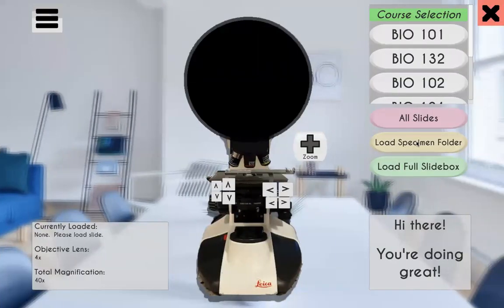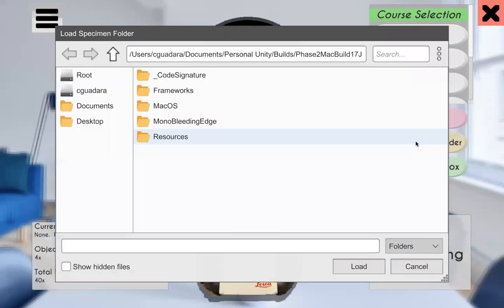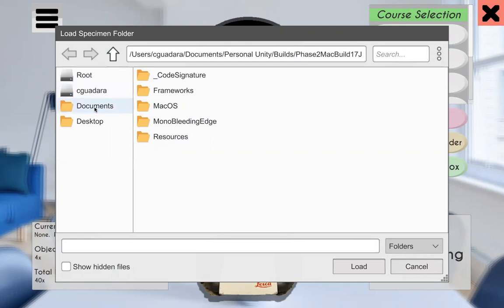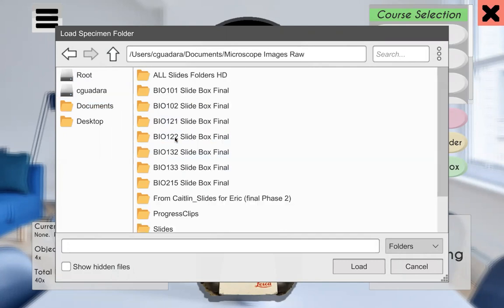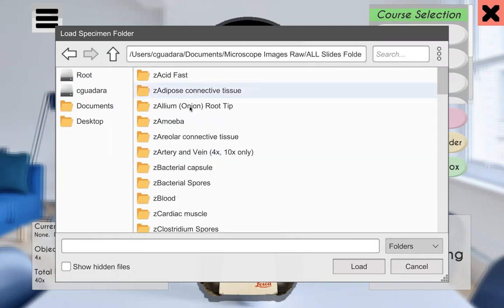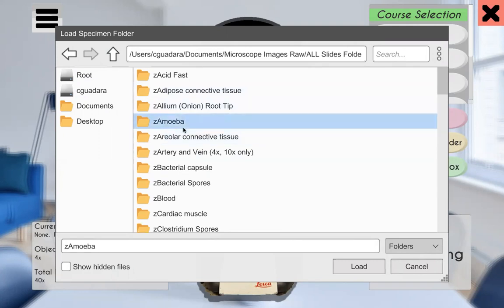Now to load a specimen folder, all we have to do is click the button, and in the in-microscope browser, the in-app browser, I'm going to find where I saved my microscope images. I have a nice neat organized folder called microscope images. I'm going to go to all slide folders, which I have on my computer, and I'm going to load Amoeba, and I'll click load.